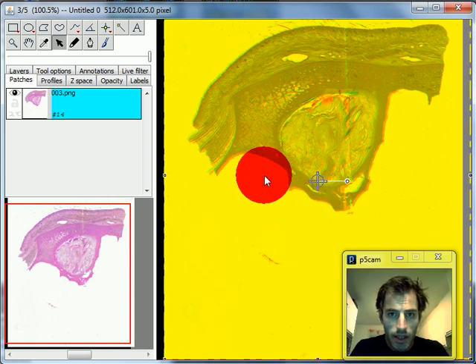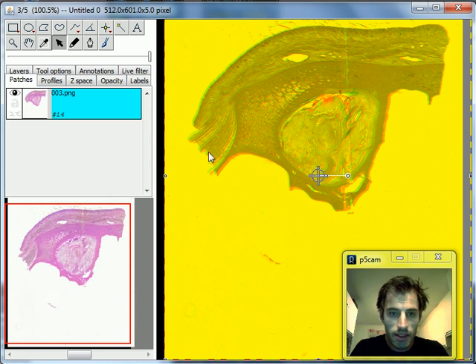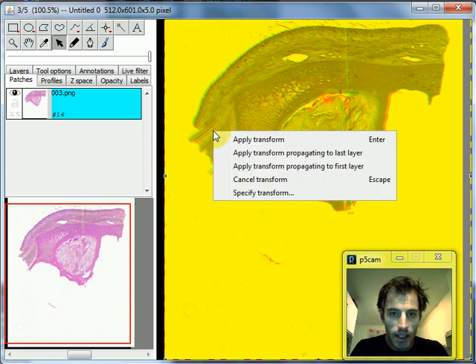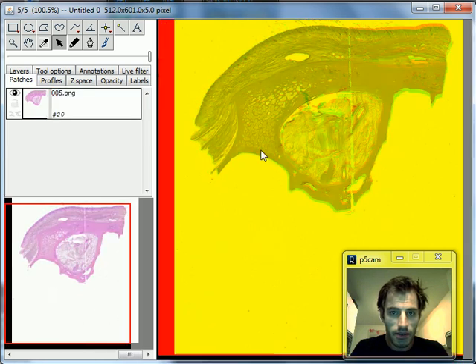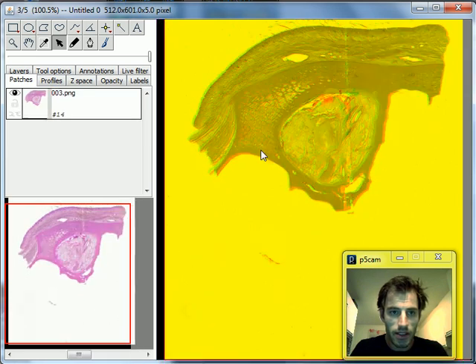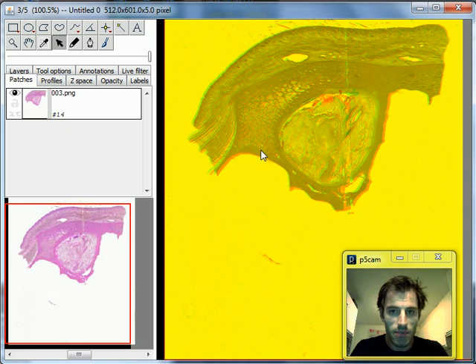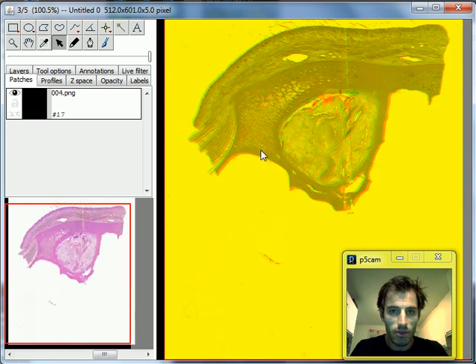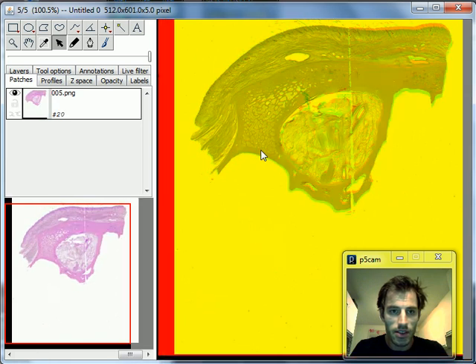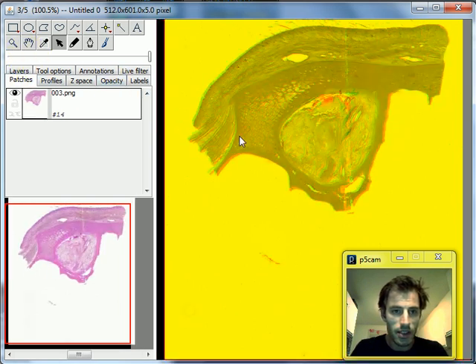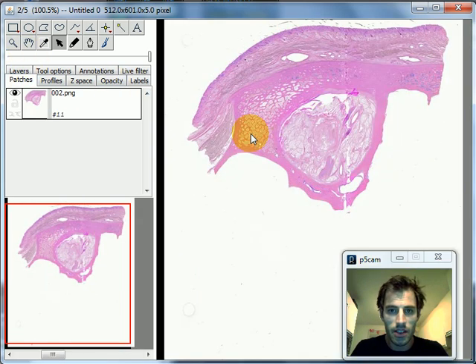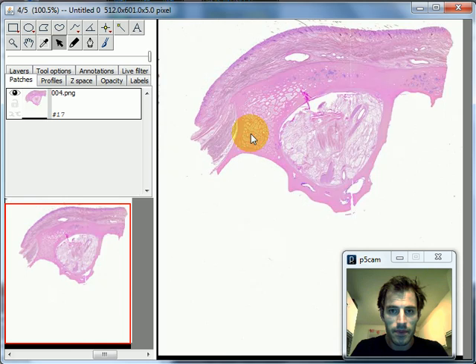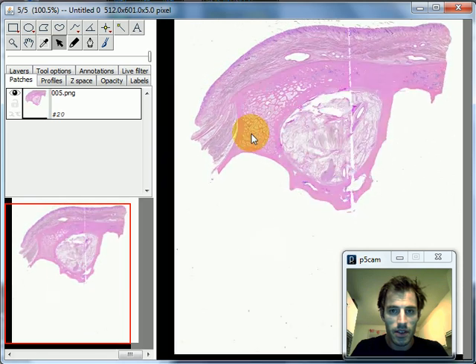So what happened now? Look, it propagated those changes in the middle of the stack to the end of the stack so that all my slices are still aligned. I go back to the front to lose the red-green—they're pretty well aligned there we go.